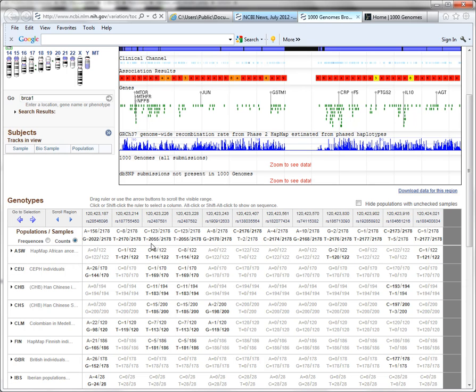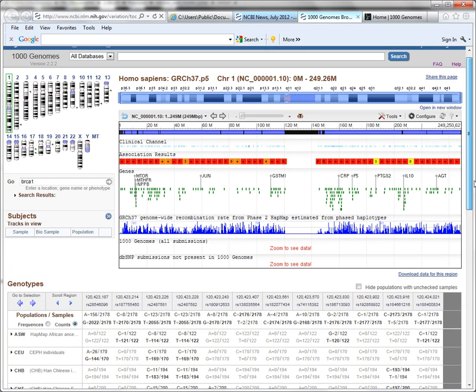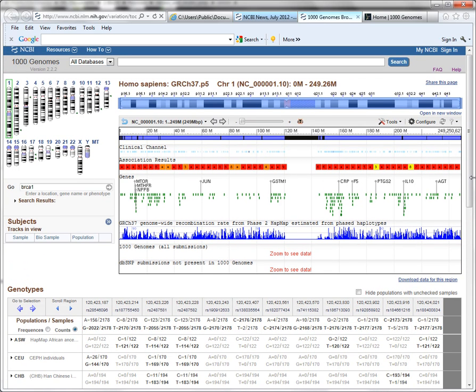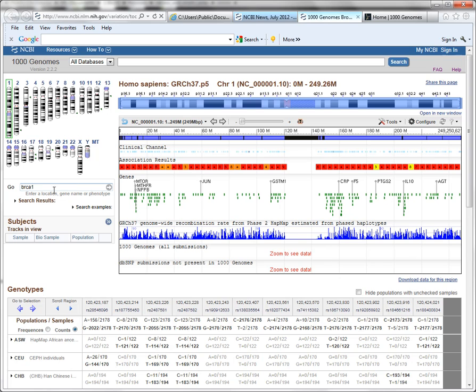So those are the main widgets on the 1000 Genomes browser page. The additional widgets that you should be aware of, that you may or may not notice the first time you're there, is here is a search widget. So you can enter, as it says here, a location, a gene name, or phenotype.